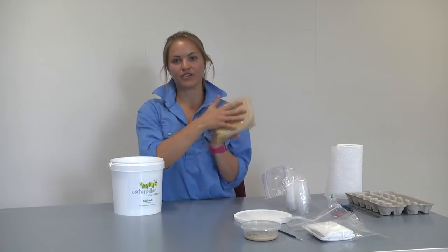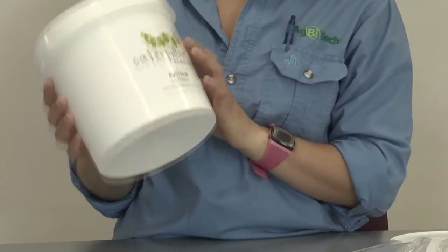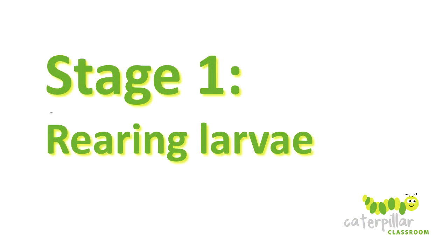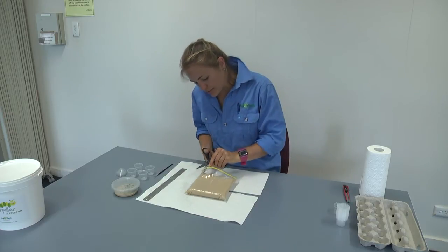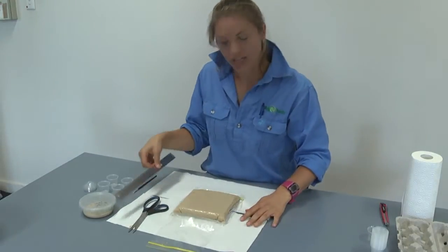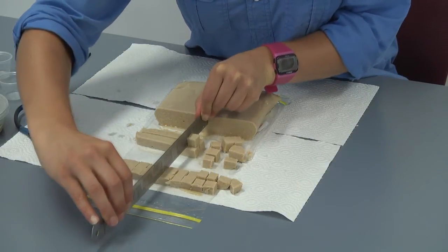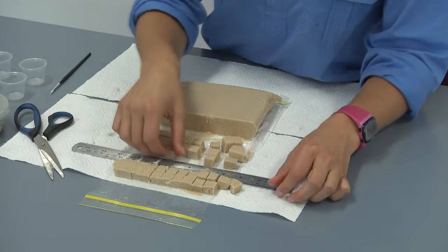You will also find a bag of diet which is for the larvae to feed on. This bucket will be used in the latter part of the rearing stage as the moth bucket. To start the larval rearing process, take your diet and cut open the bag with a pair of scissors, then use your ruler to cut the diet into small cubes.